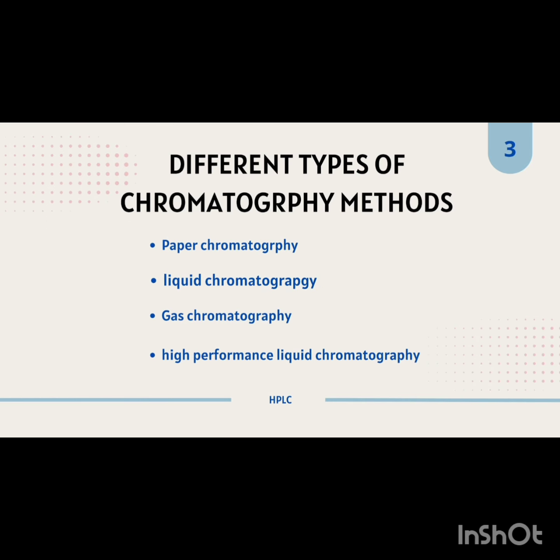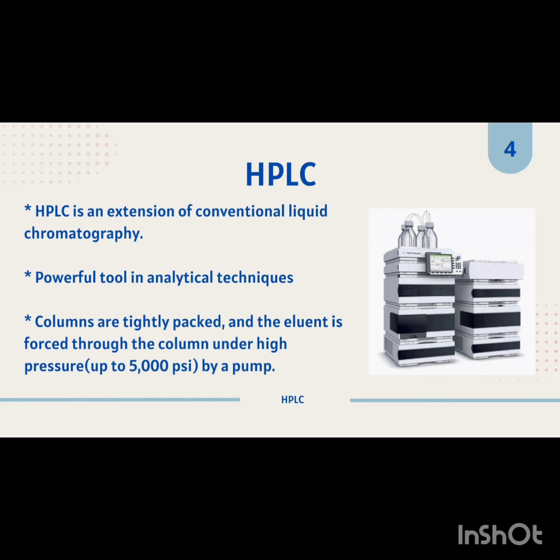Different types of chromatography: paper chromatography, liquid chromatography, gas chromatography, and high-performance liquid chromatography, HPLC. HPLC is an extension of conventional liquid chromatography, a powerful tool in analytical techniques.